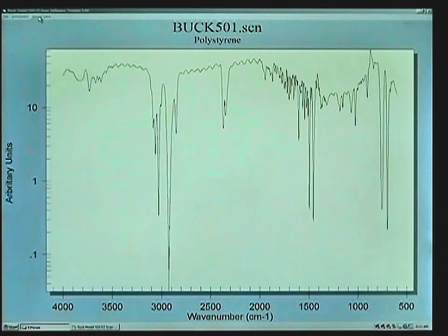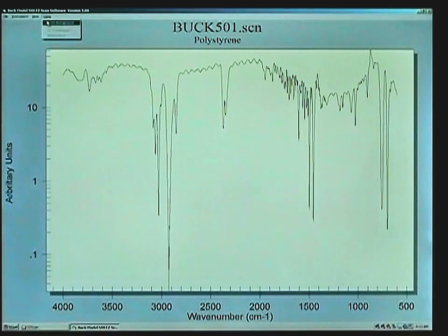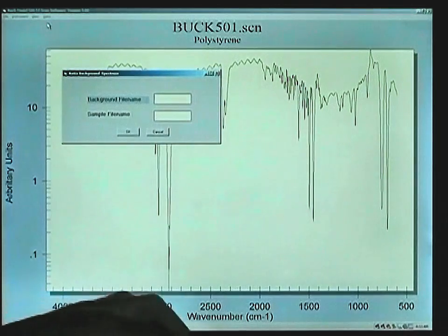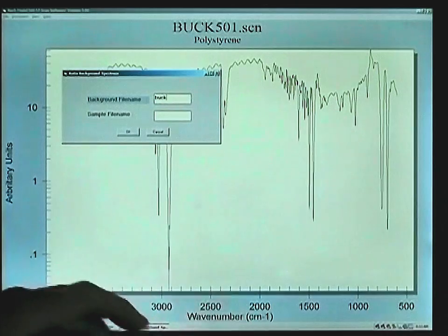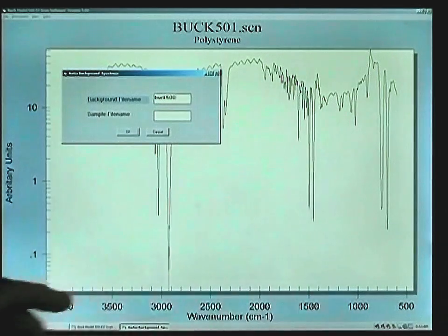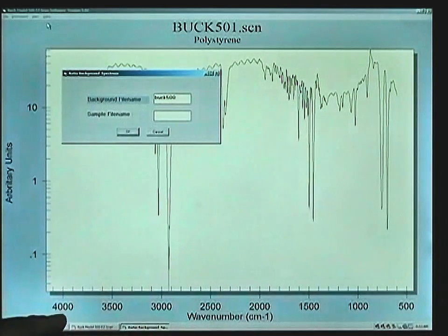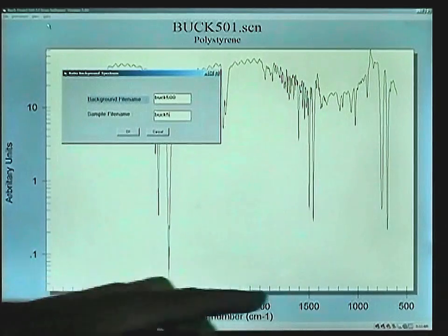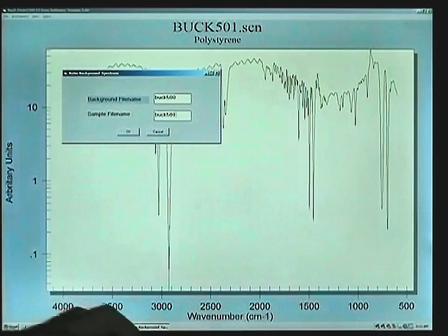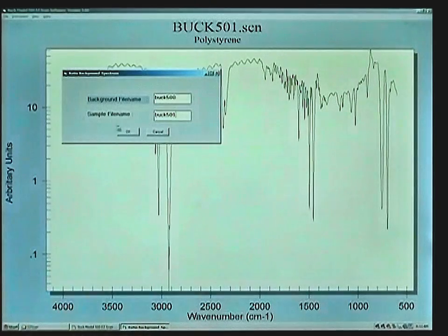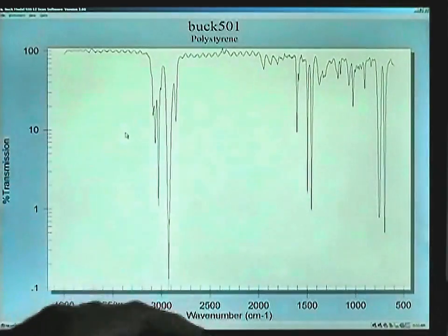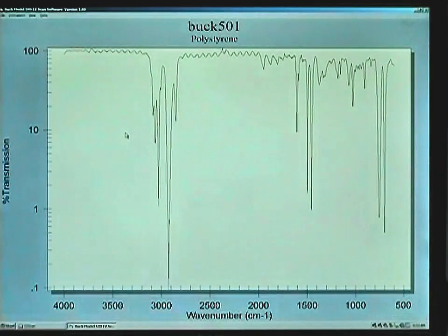We can now click on Data, Ratio Background, select the background file name which is Buc500, our sample file name which is Buc501, click OK, and we have our ratio percent transmission scan on screen.